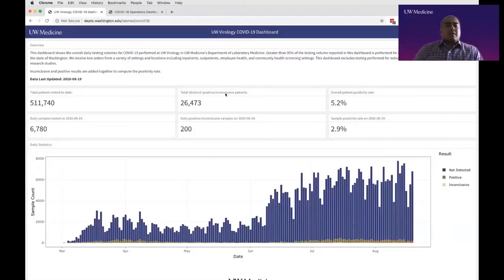Thanks, Shannon. So we've had, obviously, most labs have been integrally involved in the COVID-19 response, and early on we identified that we really needed a set of key performance indicators, and really needed to be able to do a deep dive into our data to adjust things, not on a normal timescale for a lab, but really on a daily basis. And so I think our analytics have been important for that for us.